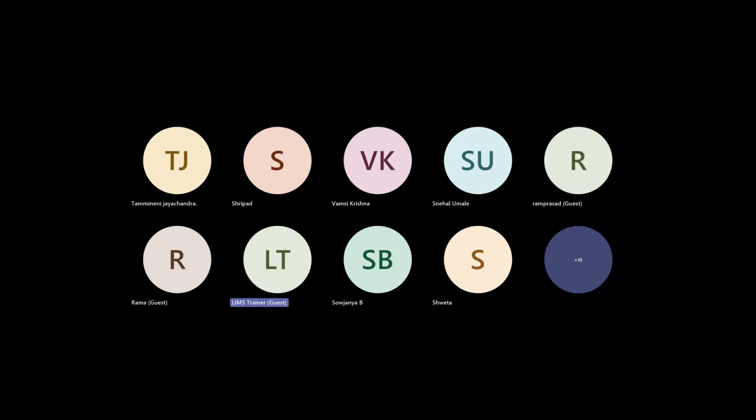Now, LabWare LIMS uses something known as an access routine and a query tag with Crystal Report, and with these you can generate that report. I can teach you what an access routine is and what a query tag is, because this is a part of LabWare LIMS. But if I go into Crystal Report, that is another 30 hour course. Because Crystal Report means your entire LIMS database, pulling the database, and everything inside Crystal Report is a bit different. That is a separate topic, a separate big chapter.